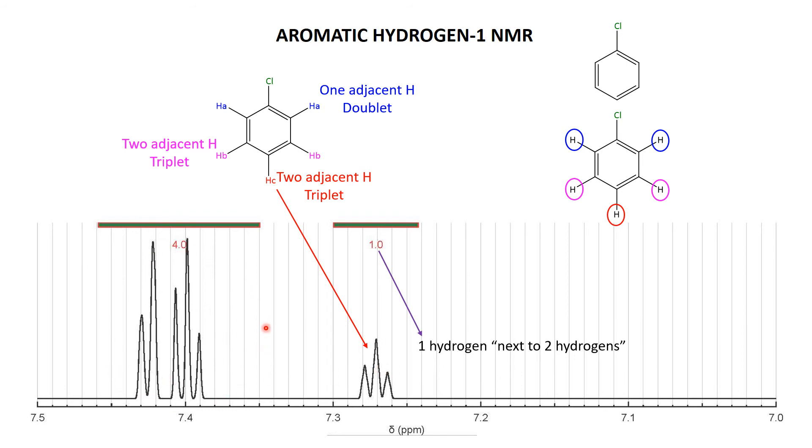Now let's look up here. What do we have here? Well, initially it looks like a little mess. Let's think about what we're expecting. We're expecting this area to be both Ha and Hb, and indeed the integration is telling us that there are four hydrogens in here, but it's not able to split them up because they're all mixed in with each other. Well, let's look a little bit further and think about what do we expect to see here. First of all, in terms of a doublet, for the doublet that corresponds to the Ha, two of the four hydrogens there, doublet should be two peaks of about the same height. Well, how about those two peaks there? That's a doublet, right? Two hydrogens because it's about half of the four, next to one hydrogen. So that fits quite nicely with Ha.